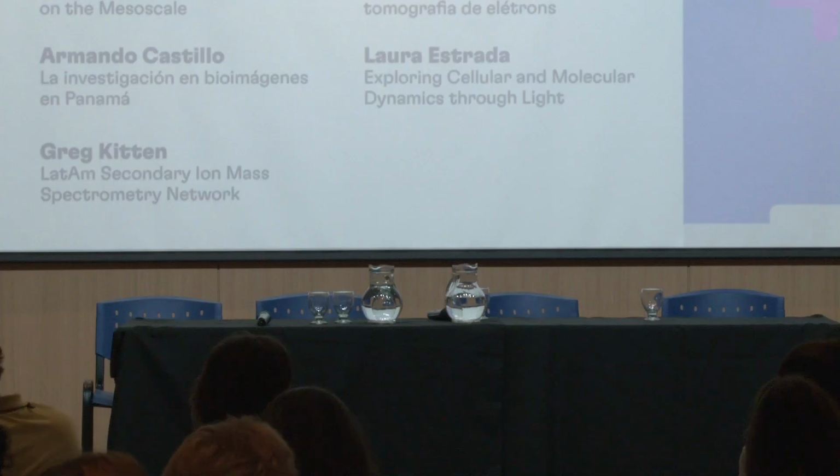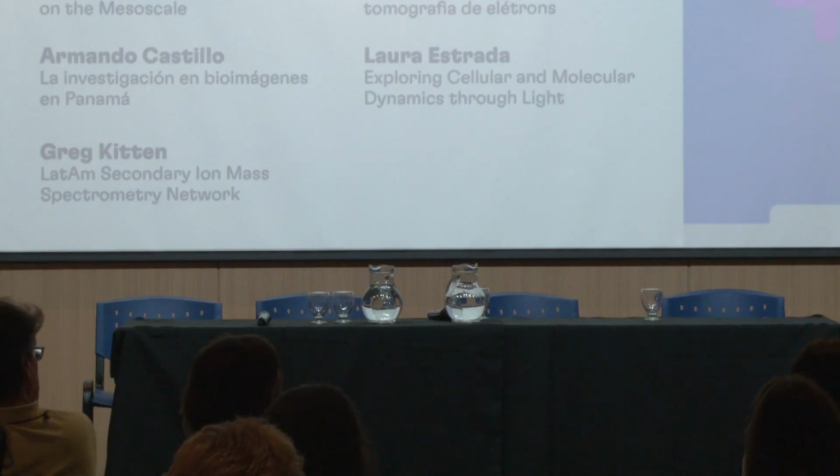Hi everyone, it's really great to be here today. I recently moved from Scotland to Chile, so this is such a fantastic introduction to the vibrant Latin American bioimaging community. Today I'm going to talk to you about some core techniques that I use in my research, which is calcium imaging and signal analysis. I use this to try and understand intercellular signaling in blood vessels.